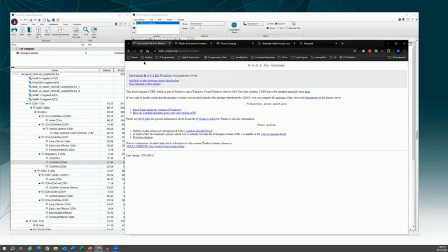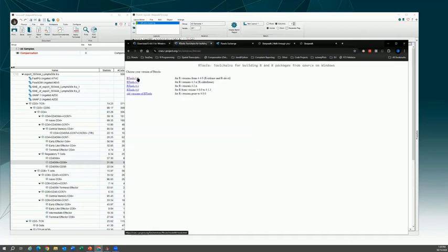When you're installing R for Windows or a Mac, it's pretty simple. On Windows, I recommend going with the default installation. It typically will go into Program Files. Sometimes it might go into the AppData folder under your local user account, and that's fine too. You'll want to install Rtools for whatever version of R you have. The latest one is 4.4. Again, running through with the default installation is the best way to get through that.